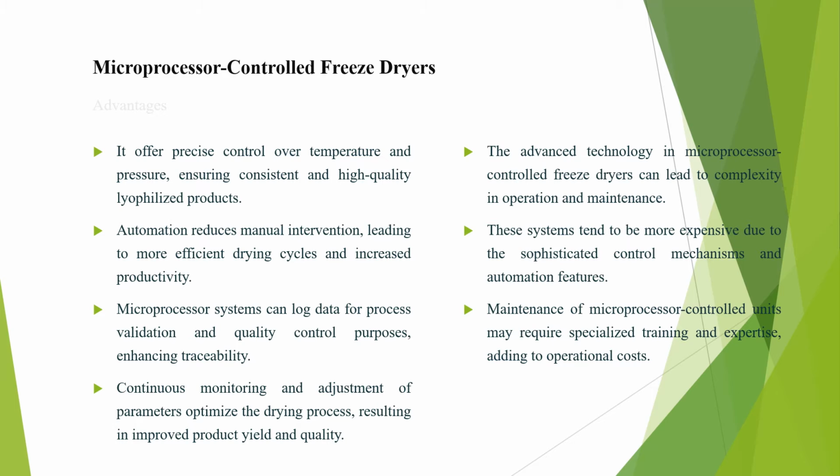Some disadvantages are that this can lead to complexity in operation and maintenance, and it is more expensive due to sophisticated control mechanisms and automation features. Also, maintenance of microprocessor control units may require specialized training and expertise, adding to operational cost.